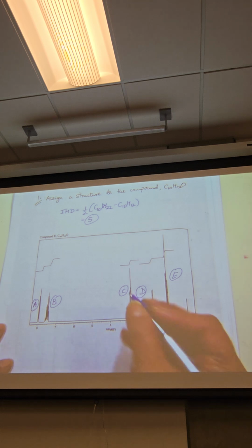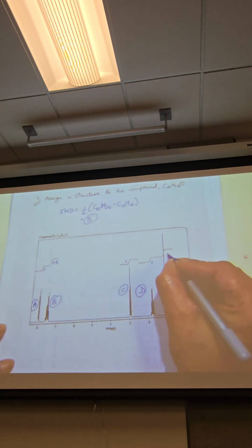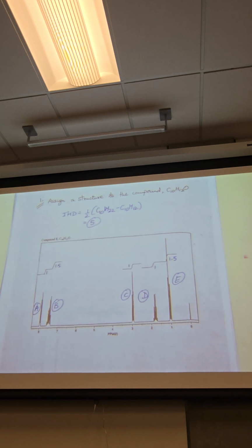I don't know if you guys have a ruler or not, but again, I'm eyeballing and I can see that this is 1.5, 1.5. Of course, a ruler is going to be a better way of doing it, so you can actually measure and confirm that's what it looks like if I just eyeball across. Okay, so what makes reasonable sense?